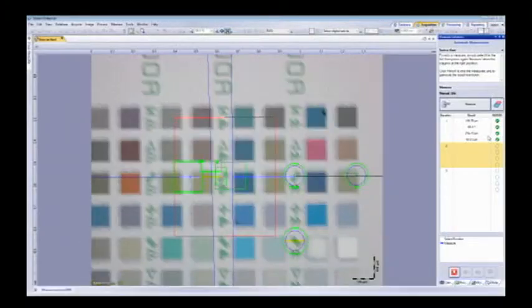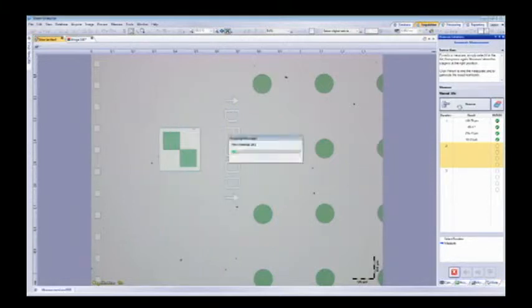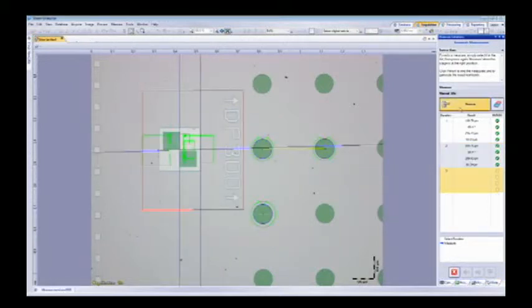Now they'll probably move to several new points on the sample, and you can see that this new point is close enough, it's within the field of view, the pattern's there. So it'll automatically find that pattern for us and mark all the measurements again. Show us the layer thickness measurement. That was, you were showing me that earlier. That was pretty interesting. Sure. Let me finish this real quick. We'll mark the last pattern.